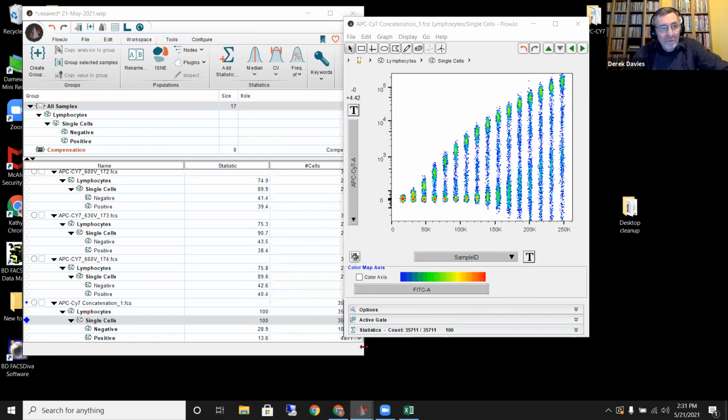Yeah, the most important thing is making sure you're getting the best resolution of your populations, and the compensation value is pretty irrelevant after that. In fact, sometimes you can have high compensation values and no data spread. And data spread, again, is more important than compensation as well. So yes, you have to consider all these things, but the compensation value, I think, is probably low down the list. You really want to make sure that you can separate those populations. Exactly.